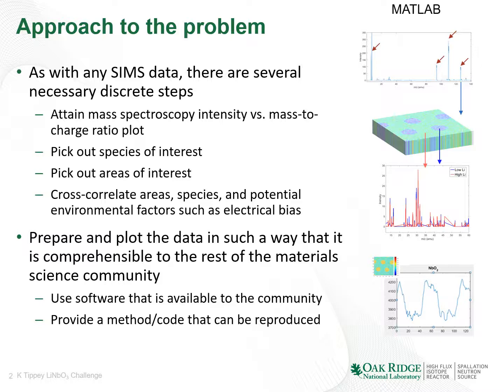So the main end goal is to prepare and plot the data so that people can understand it and potentially be able to recreate it or use it in the next steps.